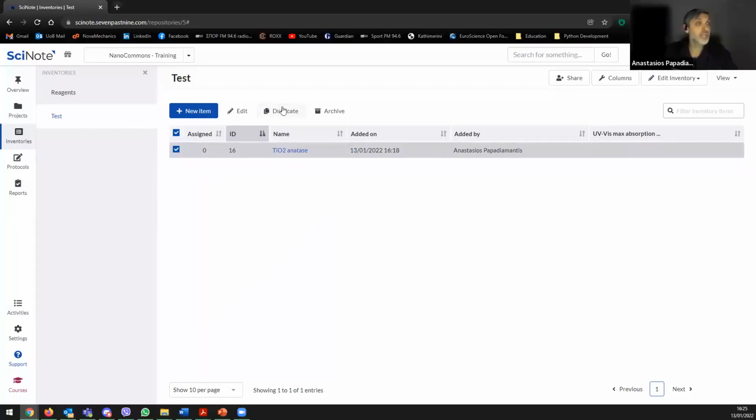What happens here? Again, you can duplicate, you can enter, you can edit it, and so on, and then copy it to a different experiment, or use a template in a different experiment, and so on. And then reporting.